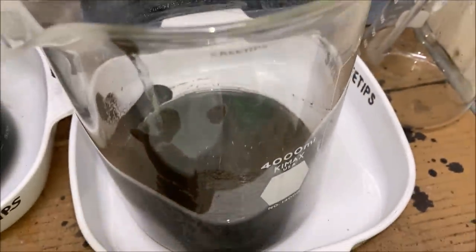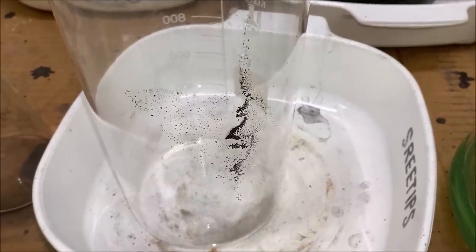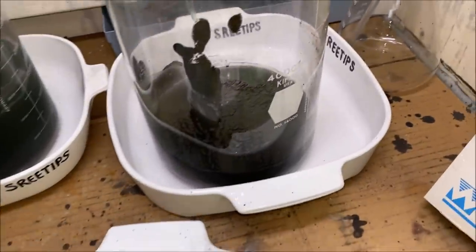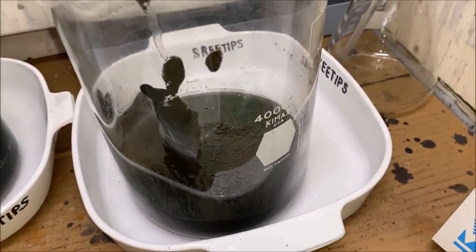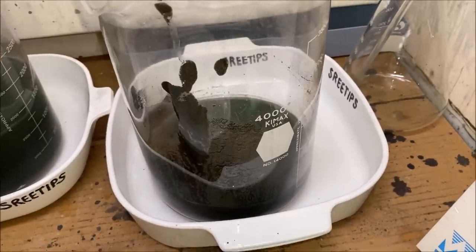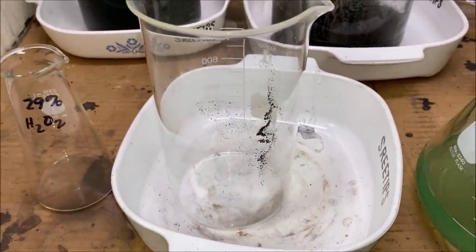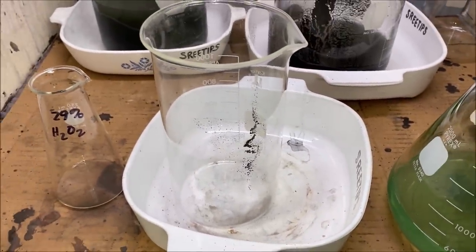What I'm going to have to do now is just treat all of this down in this beaker with the Piranha Solution over and over in our smaller beaker. I could do it all at once in a large beaker, but I'm fearful of cracking the glass with the amount of heat that's generated by using the Piranha Solution. So we'll just use a small beaker. I'm gonna do that off camera.